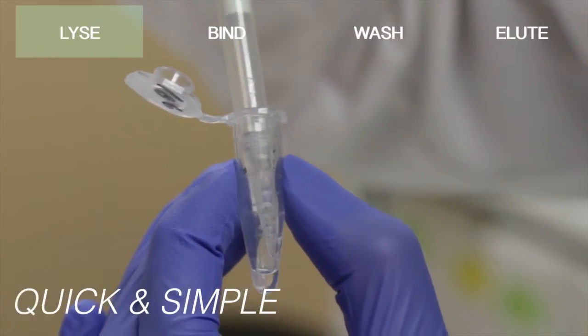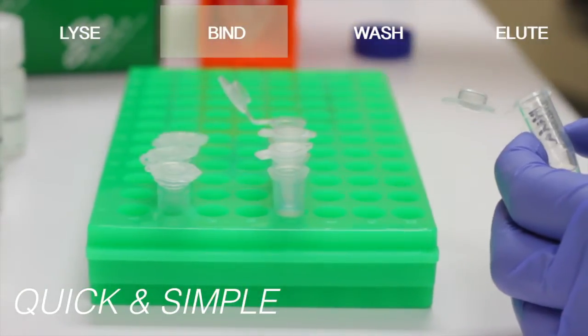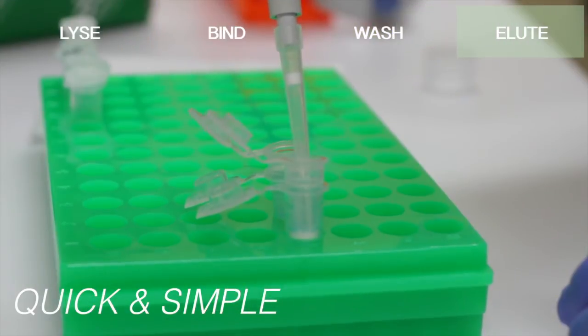The protocol is quick and simple. Just lyse, bind, wash, and elute your pure RNA.